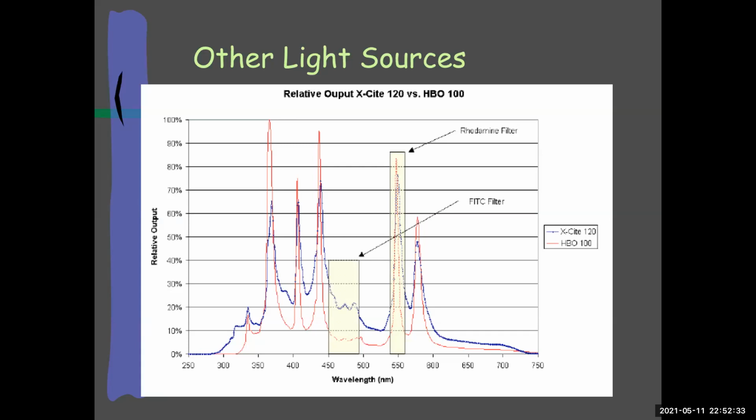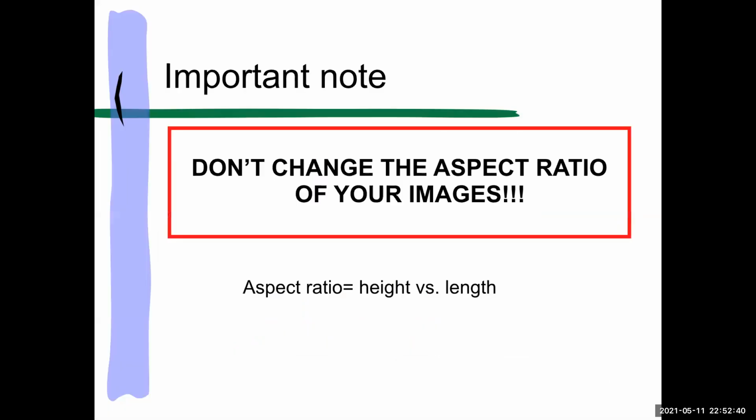And then this is just showing you different arc lamps, just to show you, look, arc lamps are different. There's a bunch of them, etc.